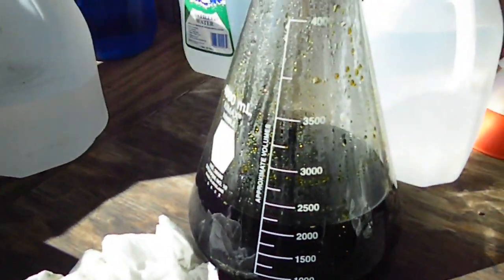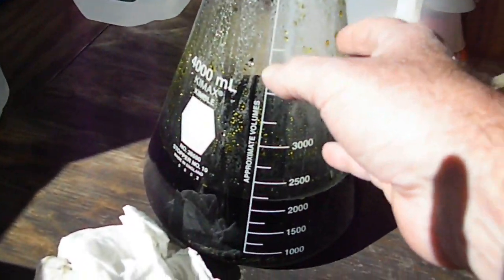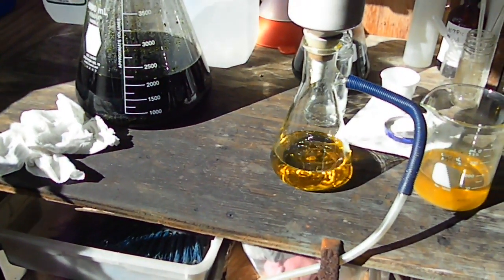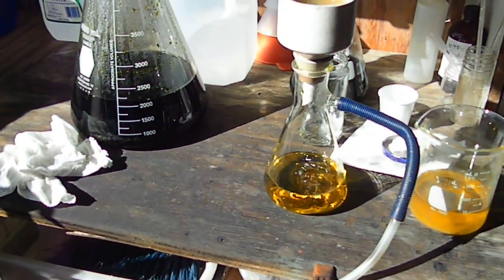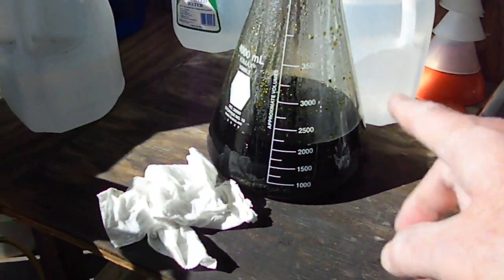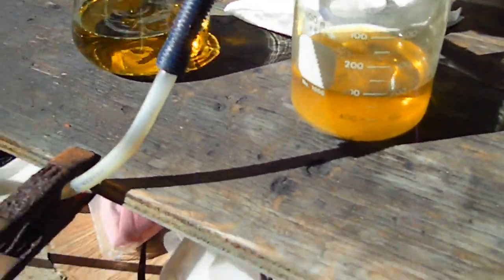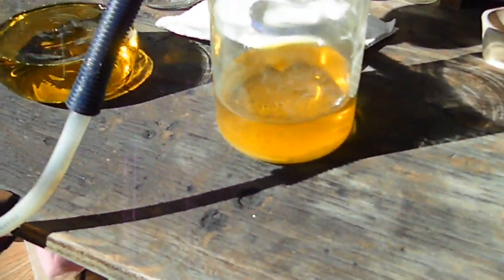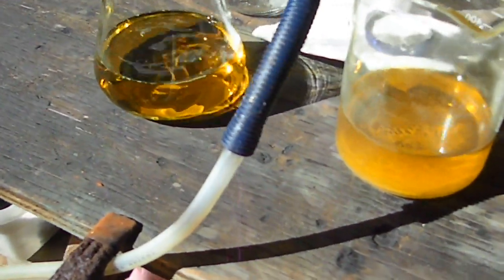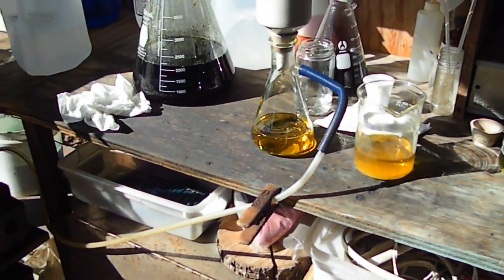I'm gonna go ahead and get this other stuff filtered off again. What I think I'm gonna end up doing is splitting the solution between these two big flasks and doing our drop that way, because we still probably have to add a couple thousand milliliters of distilled water to this. Once we get everything neutralized and it's coming through clear, we'll do our drop. You can see the difference between those two - pretty big difference between the two.